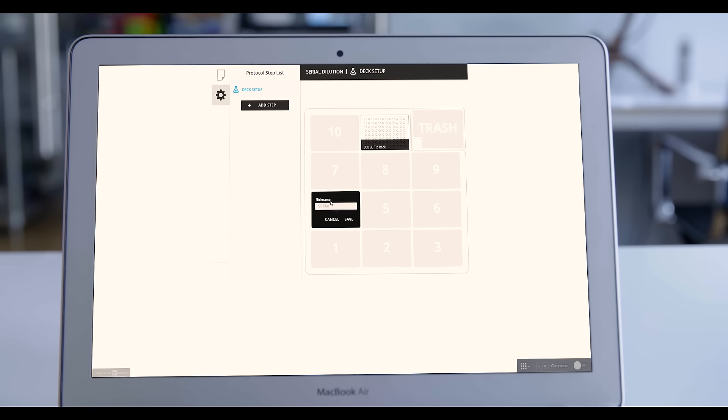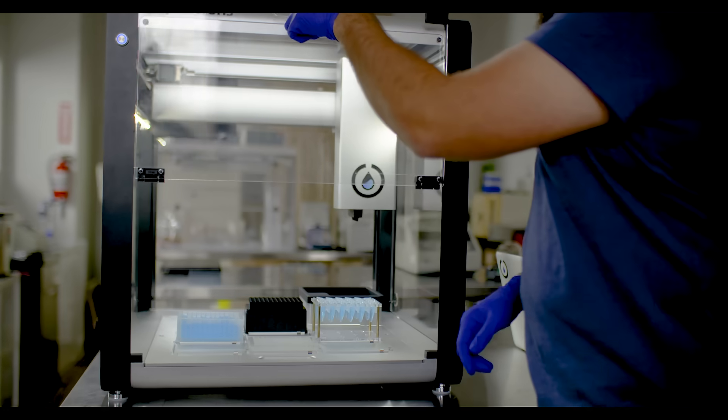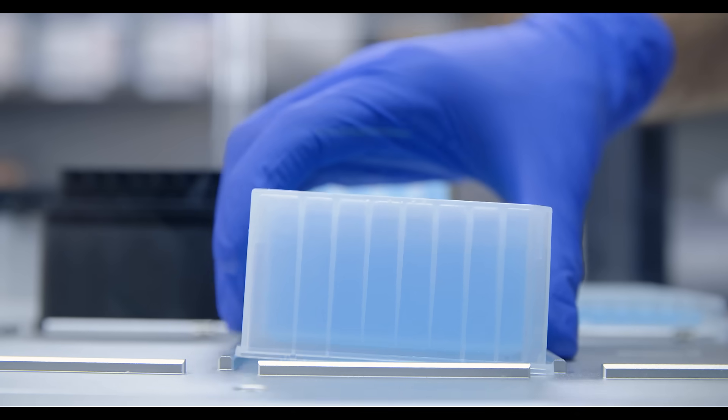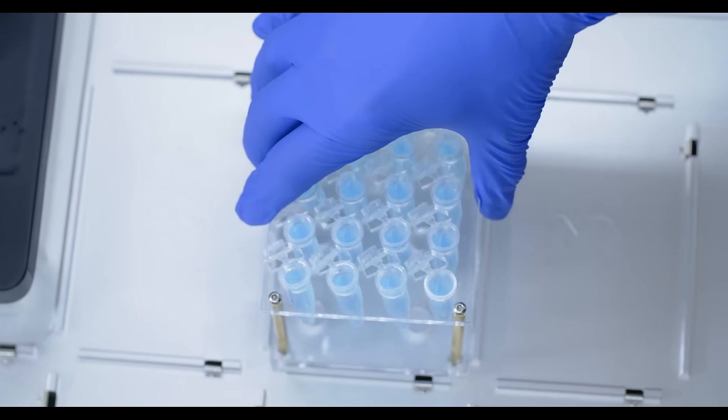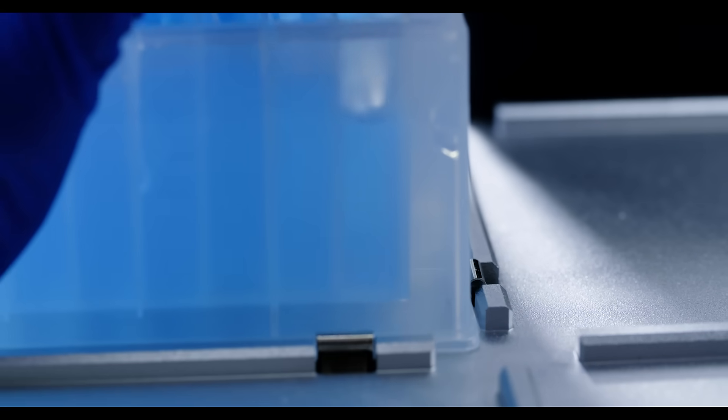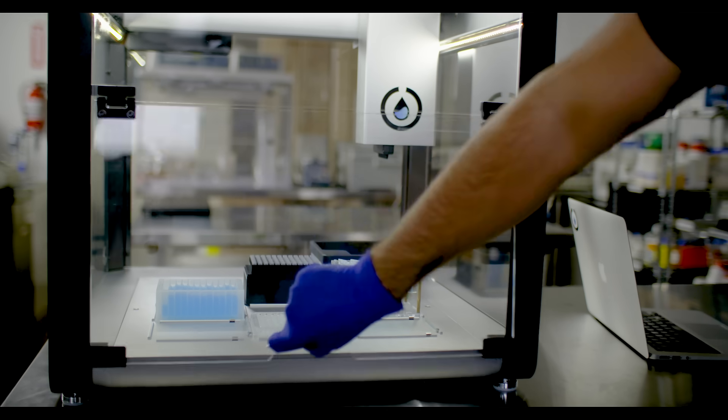Once you have exactly the protocol you want, you can simply send it to the robot to be run. And it's easy to set up a new run. All you need to do is remove your samples from the previous run and put on the new reagents and consumables, securing them easily on the precision-made deck.